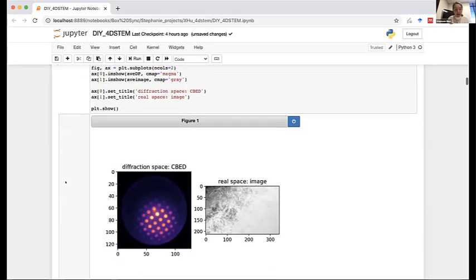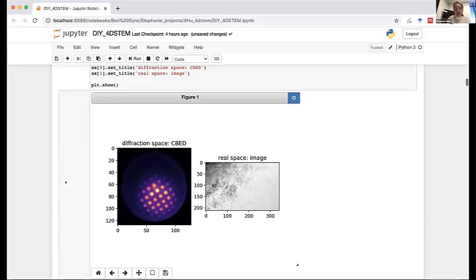So this is the end of the first section, where we're just talking about loading the data and getting a basic overview of what's going on. We've used some basic tools in NumPy and Matplotlib to start taking a look at our data in a Jupyter notebook. And Roberto, I'll pause to see if there's anything you want to add.